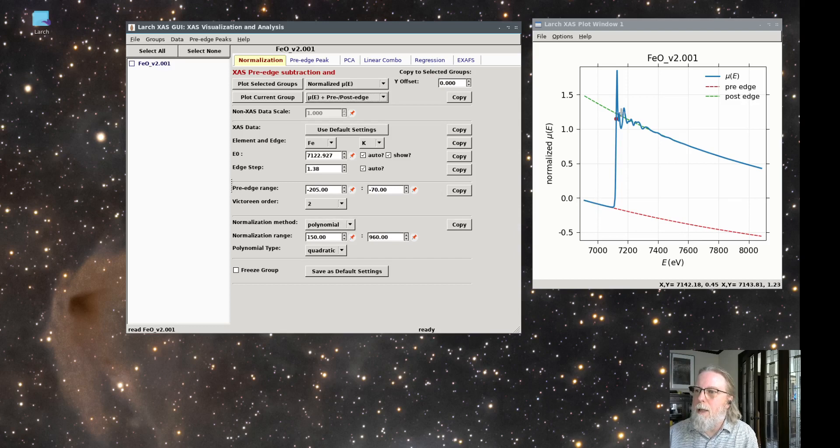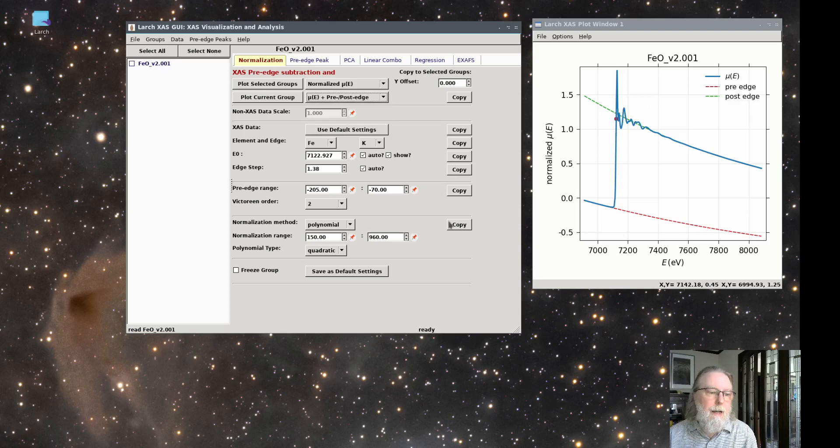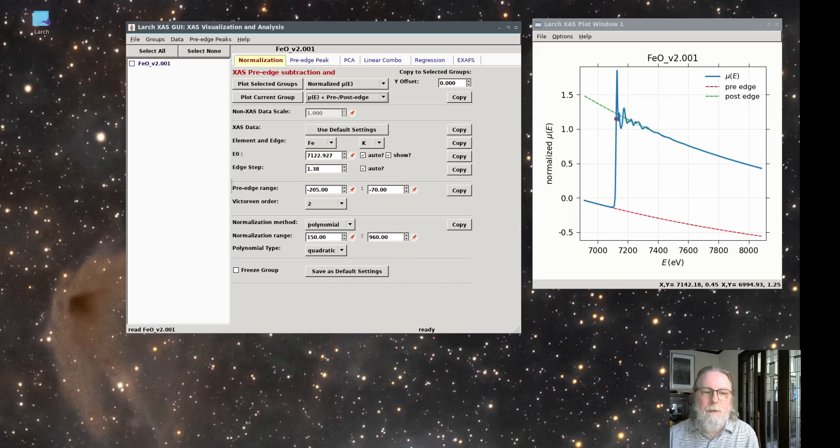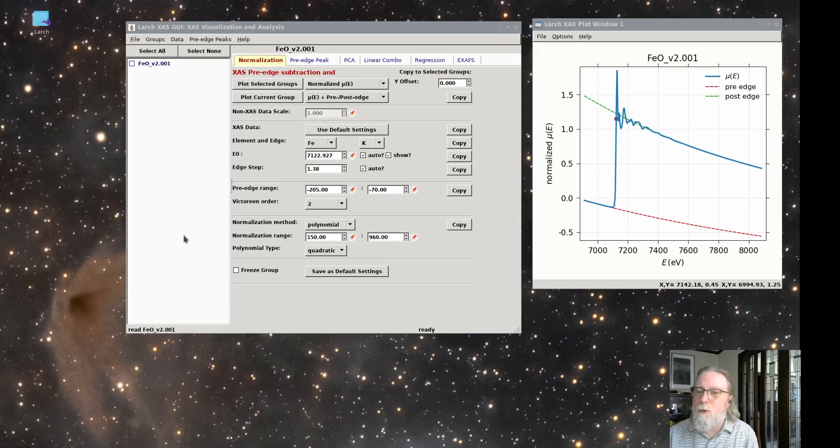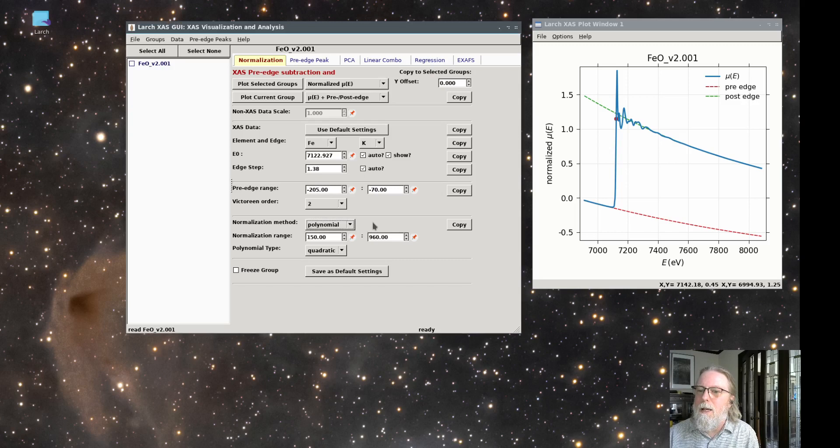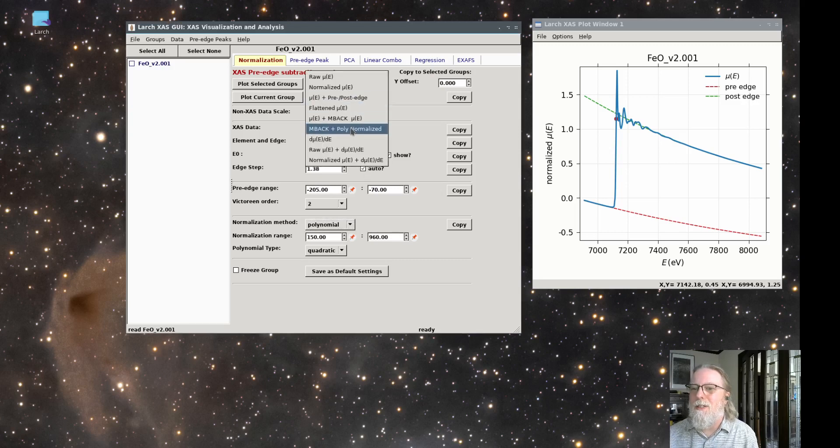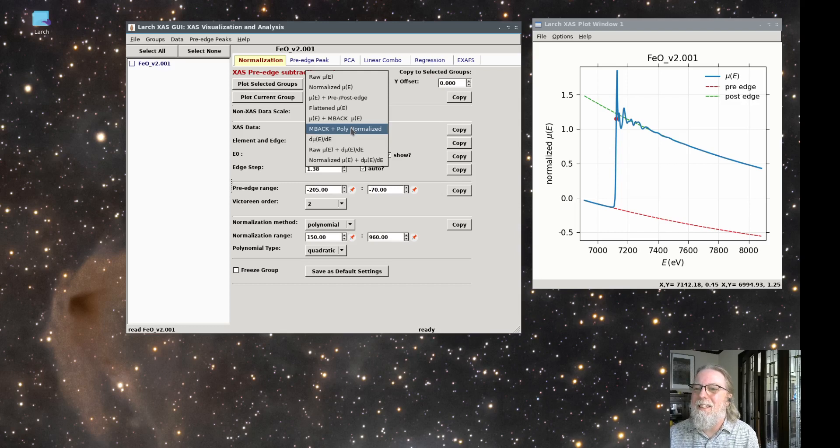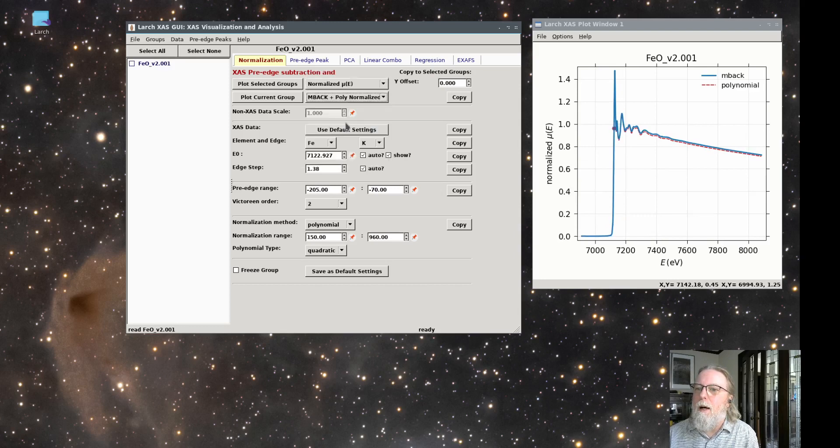For data with such a large energy range, that works pretty well. In fact, that's really why it's common to measure data below the edge extending out so far, is because this method requires it. But there's another approach, and that is to use the tabulated values for mu of E. That is the known values for how mu should decay. And this is based on the MBACK algorithm of Sushin Wen and other people in Jim Pennerhan's group. There's an MBACK paper. It's quite useful. And this method here for using MBACK is based on that work. And actually, if you use this, you should cite their work, not this.